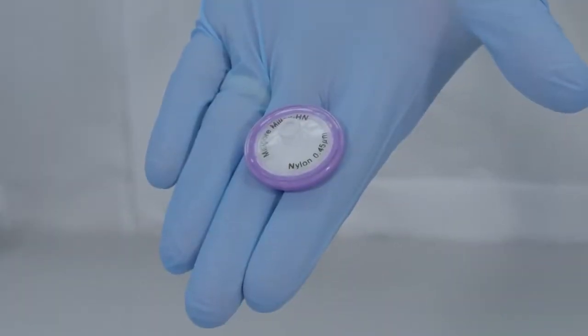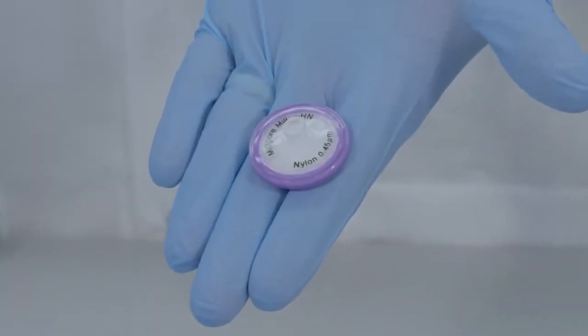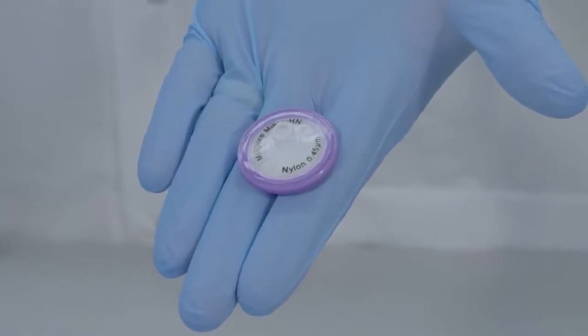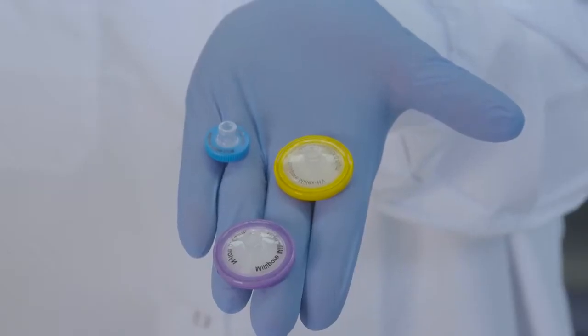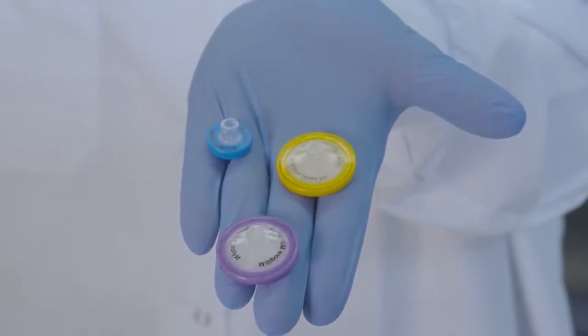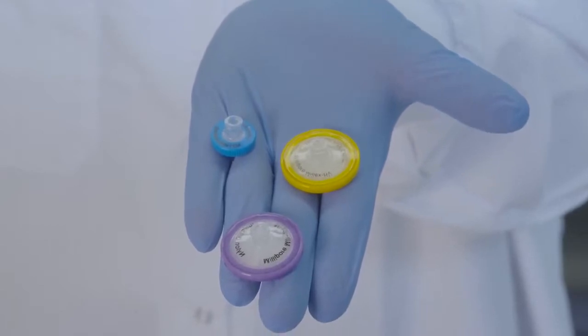And 33mm syringe filters containing PVDF, hydrophilic PTFE, or nylon membrane are bi-directional. All these filters are bi-directional since the membrane is supported on both sides.